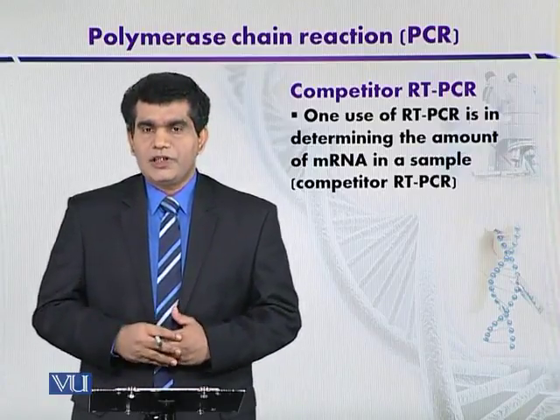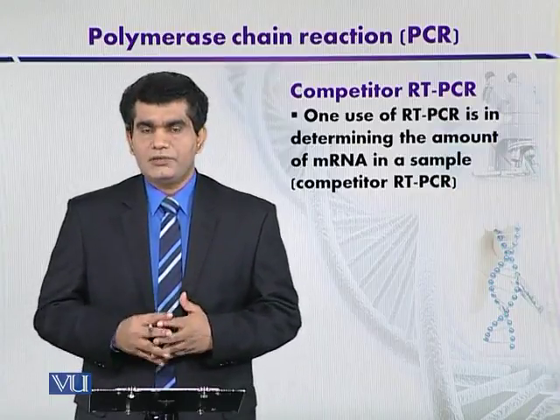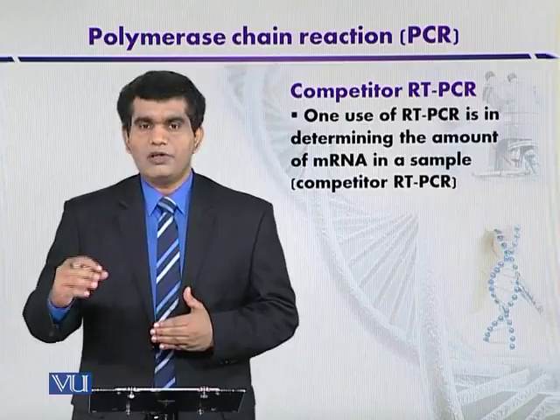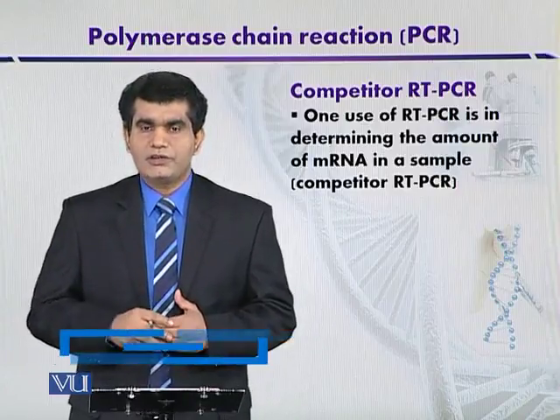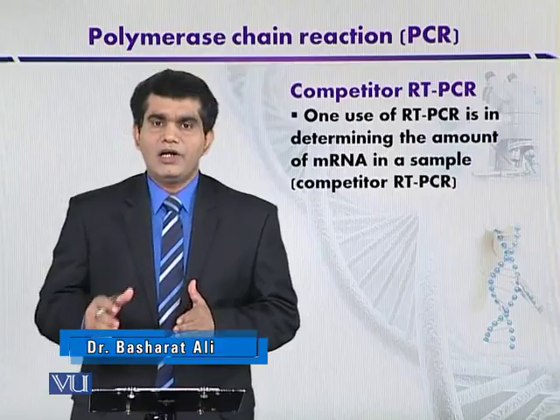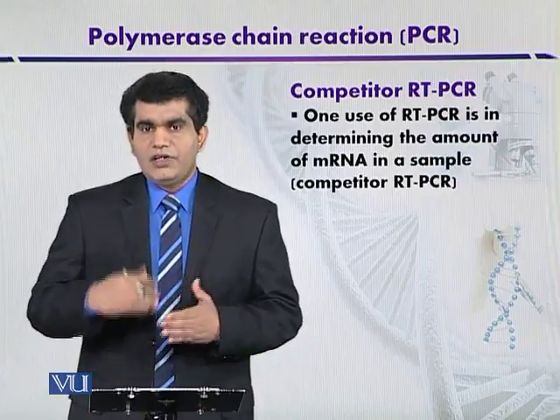पहले हमें ये पता होना चाहिए कि what is this competitor RNA? Competitor RNA is actually a synthetic RNA molecule that can be synthesized under laboratory conditions, and it can be used as a control in different PCR reactions that are based on RT-PCR. Now, what are its applications?